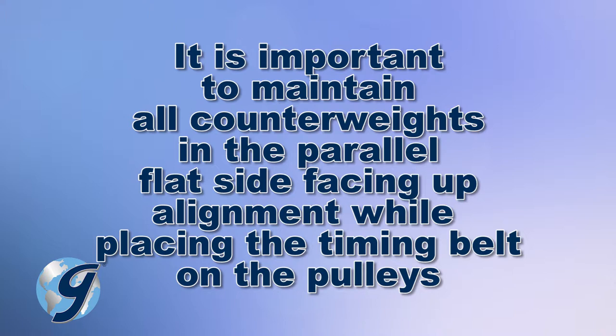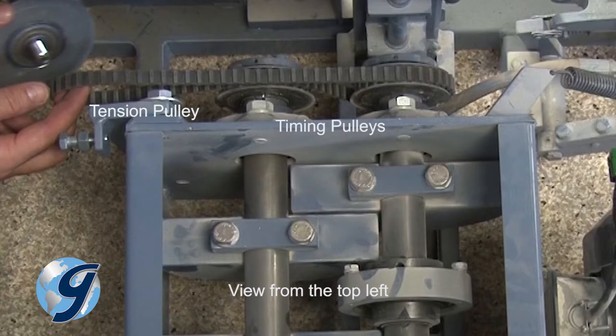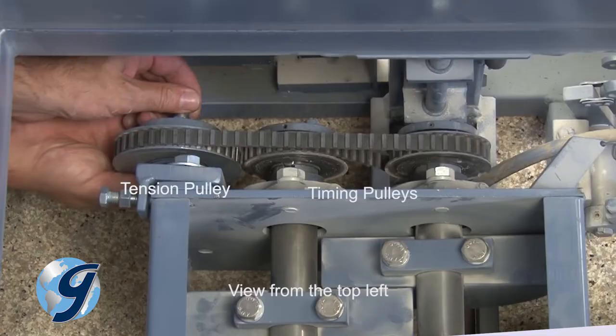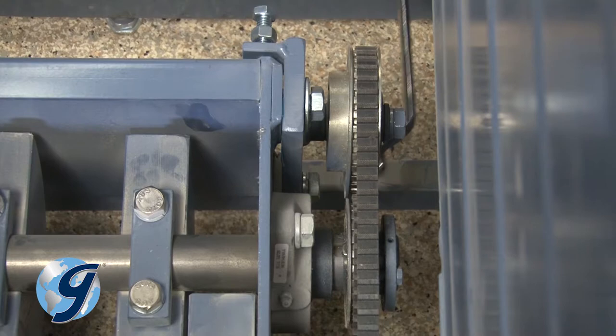Now fit the belt around the front timing pulley and over the top of the middle timing pulley, taking care not to change the rotation of the shafts and the counterweights. Next, insert the tensioning pulley into the loop of the belt. Now hold the belt and pulley together and bolt the tensioning pulley to the tensioning bracket. Turn the adjusting bolt for the proper belt tension, then tighten the tensioning bracket bolts. The timing belt tension should be tight.